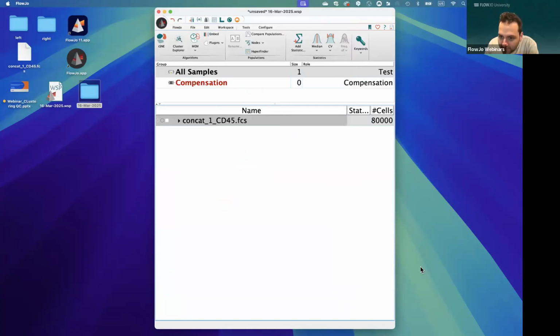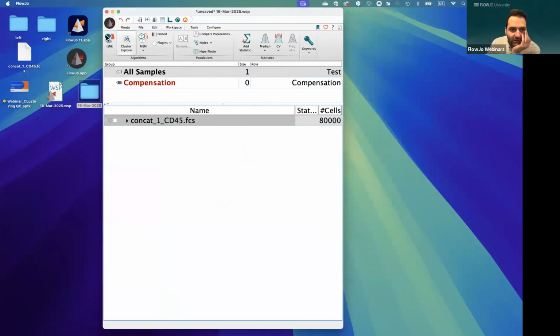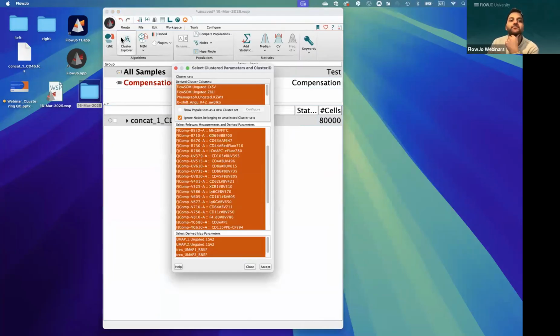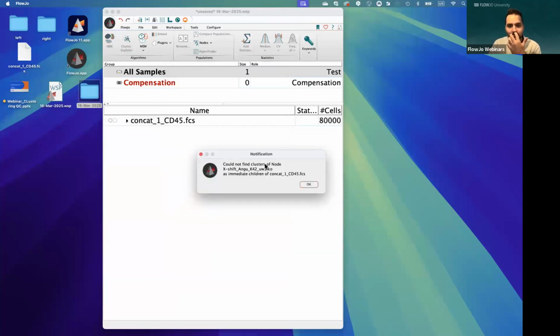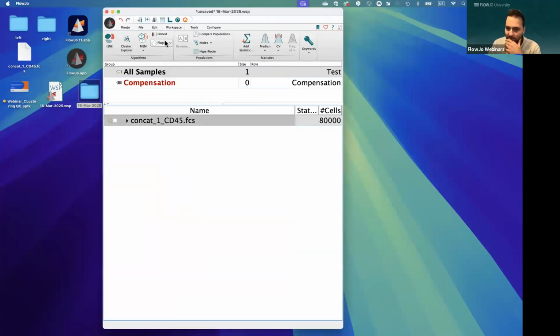Both counts and states of cells in different samples. Counts. Yeah, so with Cluster Explorer, actually, Lucas, you go to Cluster Explorer, select your clustering of choice, your embedding of choice, and you do, oops, I ran it on the wrong level.